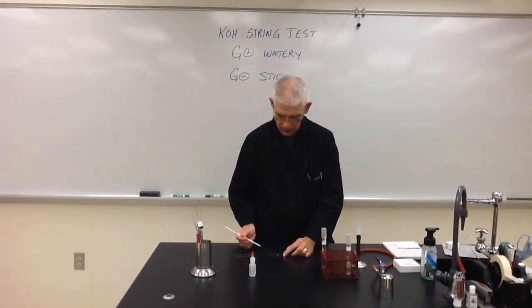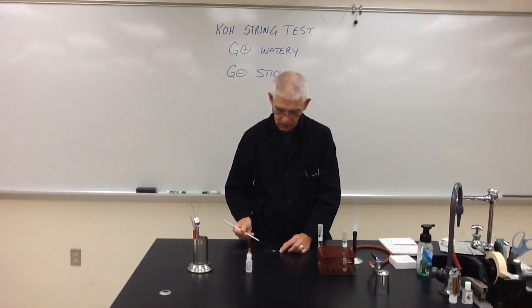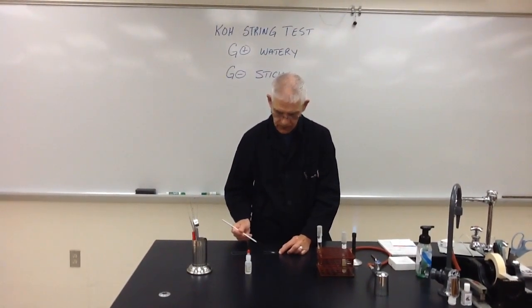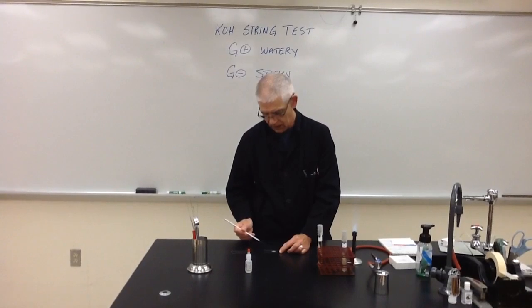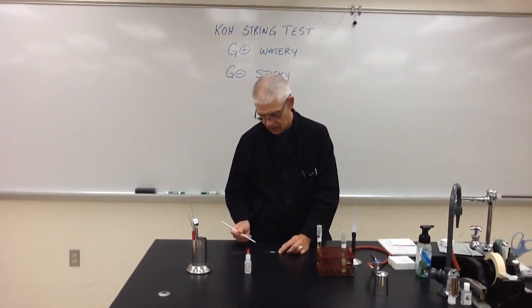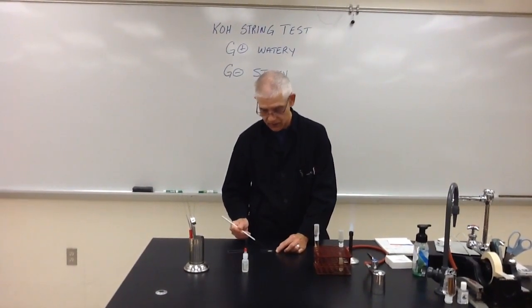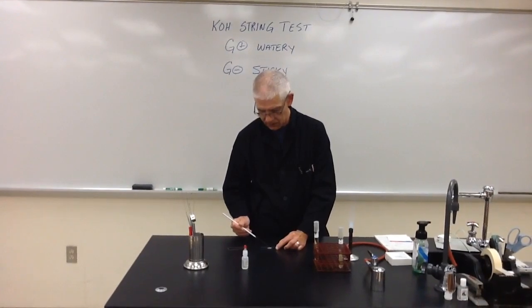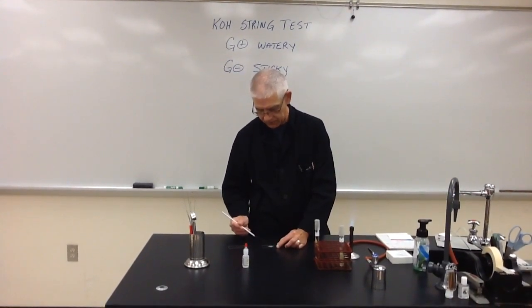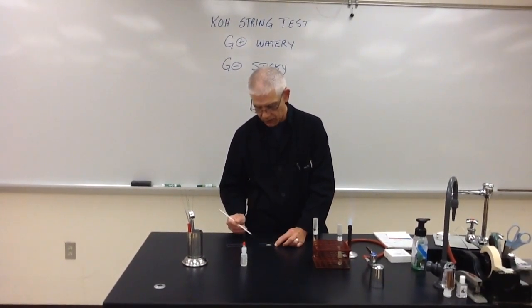So go in, get a nice amount of the bacteria, and then you're going to stick it into the KOH and basically get it suspended and basically start to go around in a circle and let it get in there really good. And what you're going to see when you do this is that the gram-positive just stays watery. So the bacteria just basically resuspends in it. When you get it all resuspended, then it's just going to remain watery.